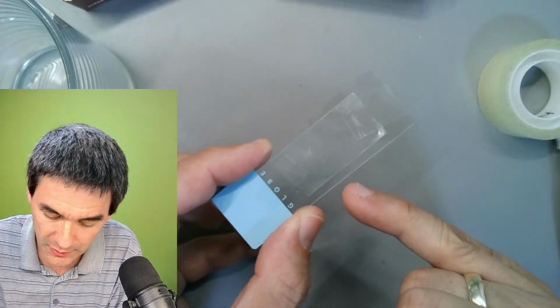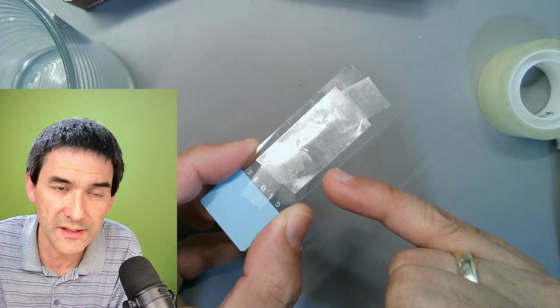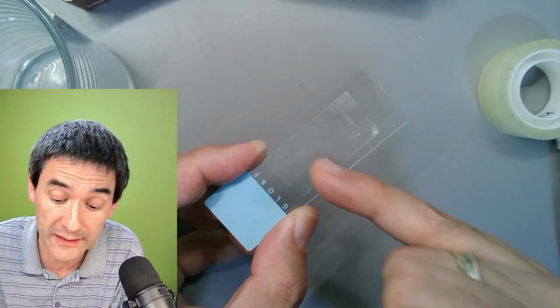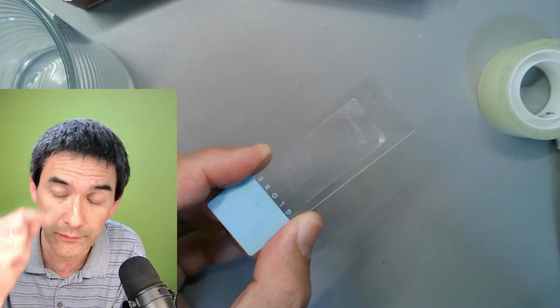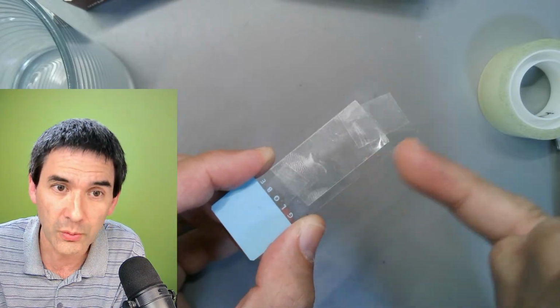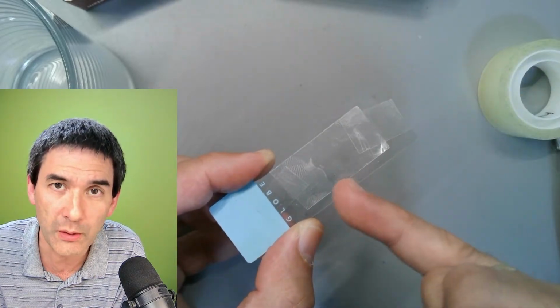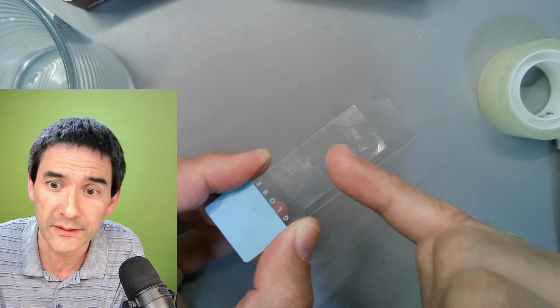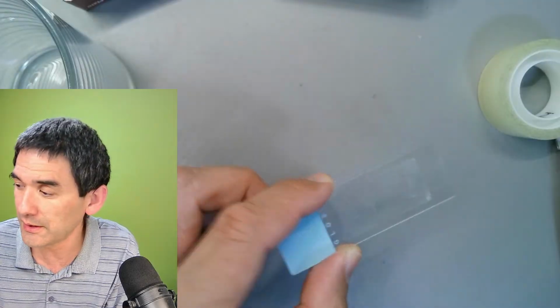Over here, somewhere in the center, this is difficult to see now, this is where you've collected, or should have collected, whatever you've had on your eyelashes. So what I'm going to do now is put this under the microscope, and I'm just going to be searching this central part here. Let's have a look.